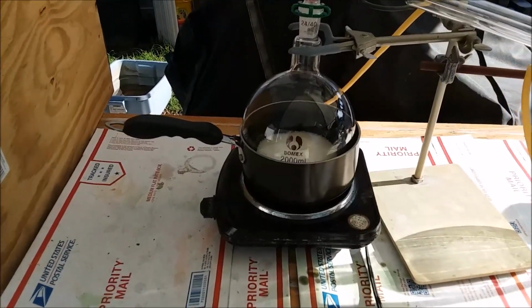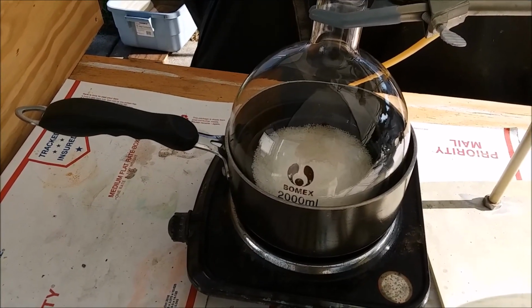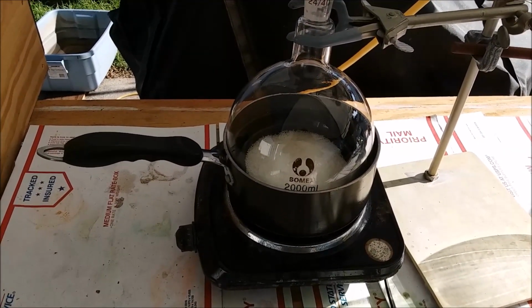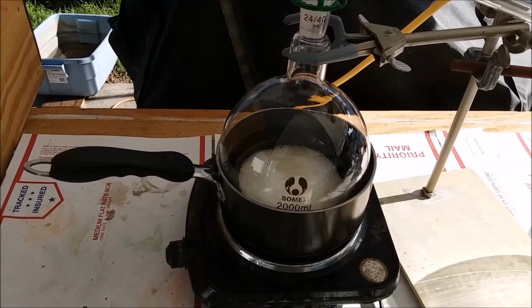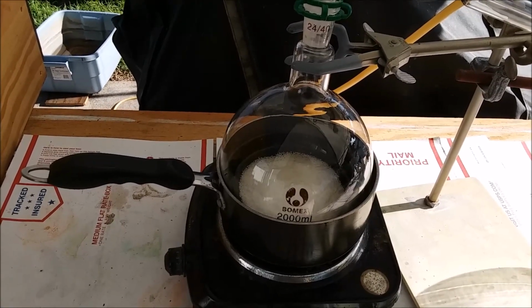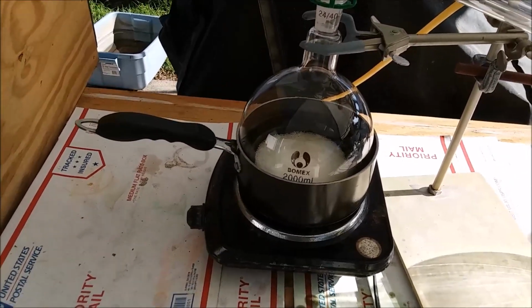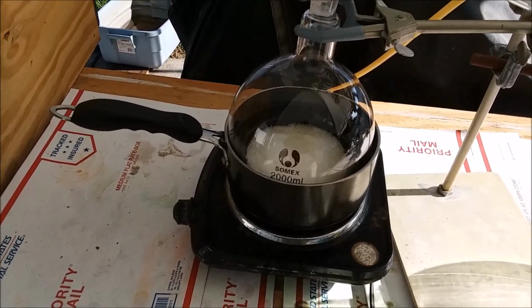Even though this boiling flask is double the size of my 1-liter flask, I didn't put double the reactants in it because of the foam up issue that happens maybe 2/3 of the way through the reaction. It just seems to be as predictable as the sunrise. Everything's going to be going really good on the reaction, and then all of a sudden it's just going to get another gear, take off, and foam up. So I didn't fill it with double the reactants, even though the flask is double the size. I put about 1.5 times the reactants in it.